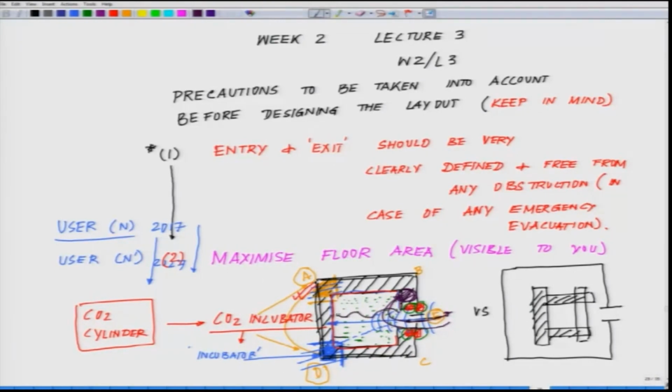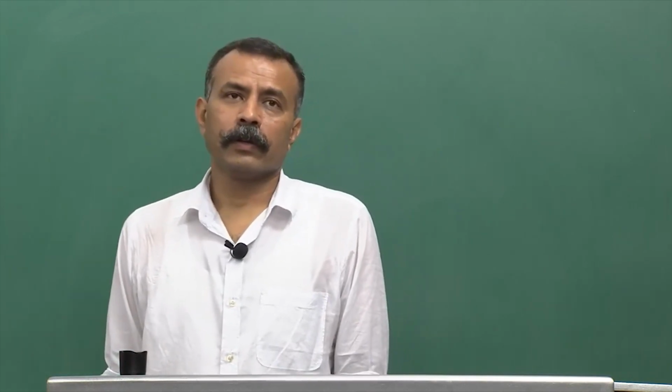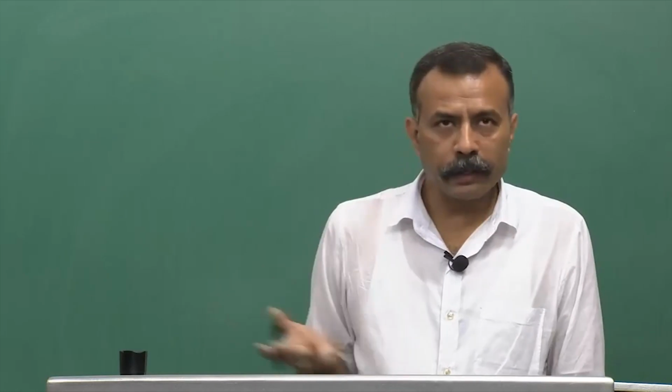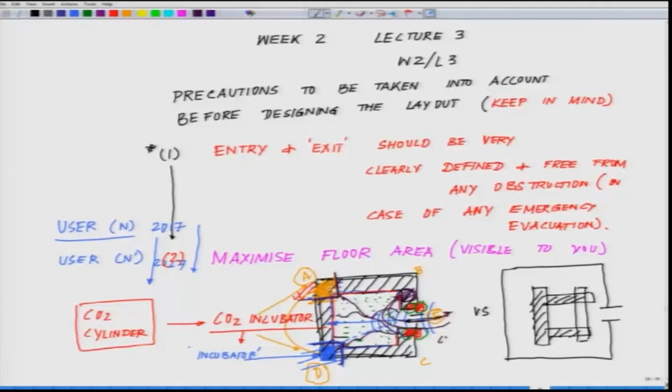But that brings us to another problem. Whenever you have an incubator in this corner, you always have to have the carbon dioxide cylinder taken all the way up to here. Whenever you do it, please ensure that you do not spoil the whole floor, and that the underneath of the nitrogen cylinder or CO2 cylinder you are carrying is at least clean enough.